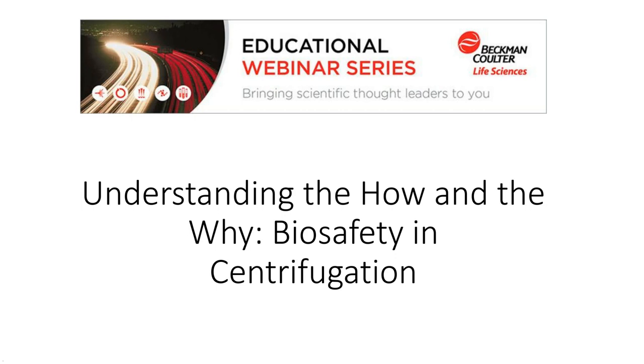Anything to add, Bob? Yes, and again, I see it just like you do as two steps. First is cleaning, then disinfection if that's a requirement. 70% is as high an alcohol content as I would recommend. That's actually what our recommendation is to disinfect. Bleach is also another disinfectant, I think it's a 5% bleach solution that we recommend.